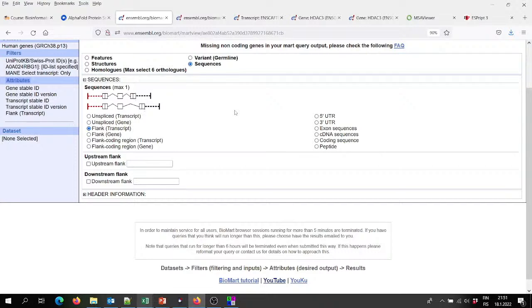This shows us the colors, what we'll get. So it is things outside of the exon. If we want to get the 5' untranslated region, it is here before the coding sequence. If we want just the coding sequence, it is here, the parts of the exon corresponding to the protein message.